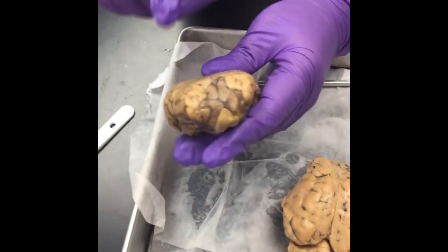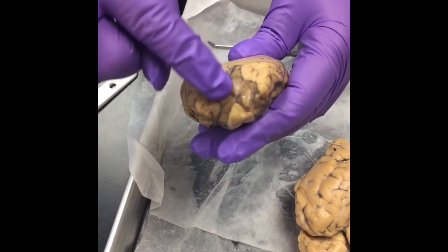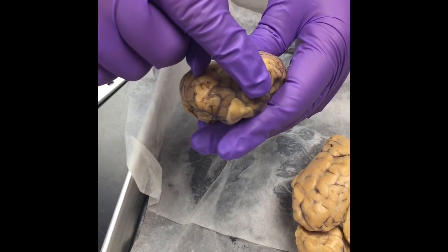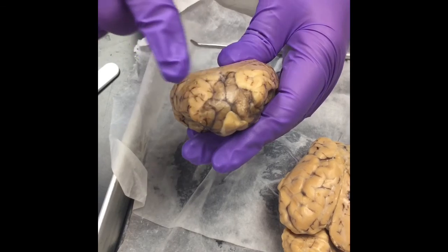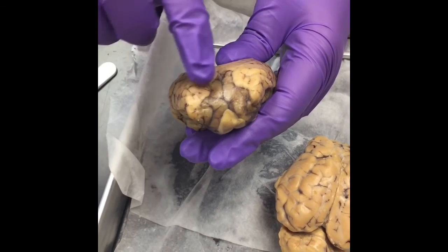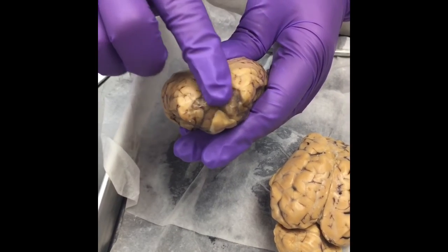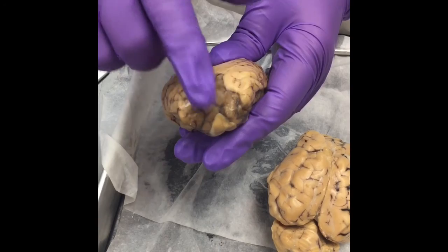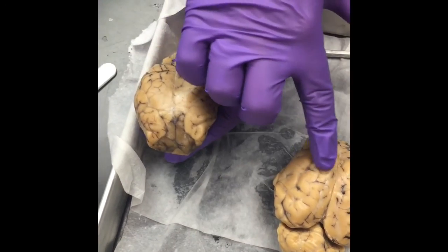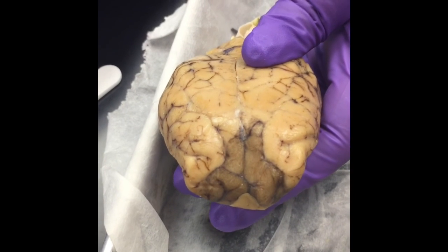Look what I could show you here. See how this part is darkened? Yeah. Okay, this is where the tissue of the brain started to die. So this was an old goat. It could have been an old goat, yeah. So there was a bleed that probably happened in some of the blood vessels coming out this way, and the brain tissue here actually started to die away. So that's why it's blacker there. And this one does not have. So is this what happens when we have traumatic head injuries? A stroke. Concussions? Stroke.